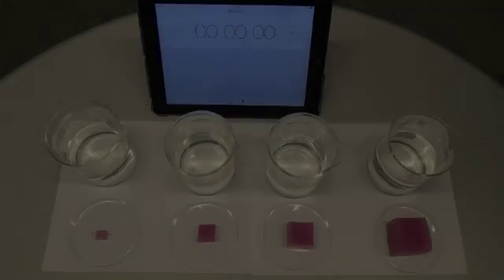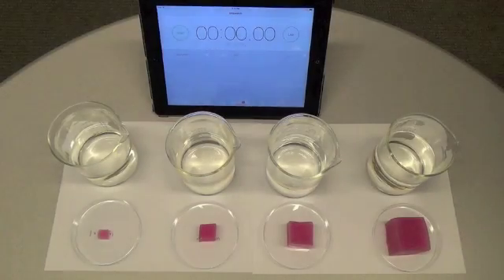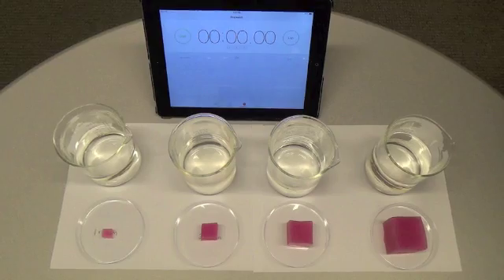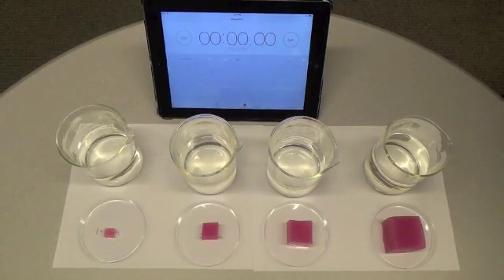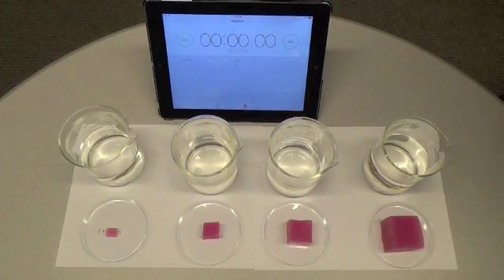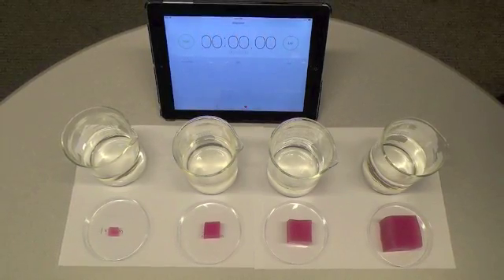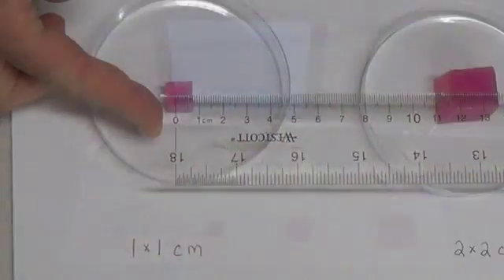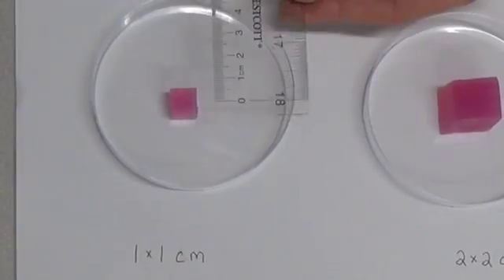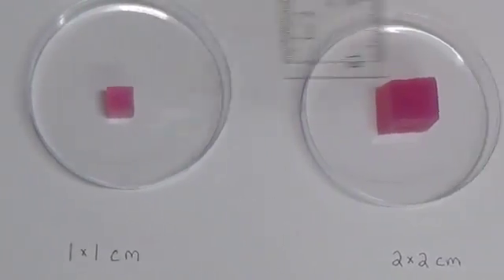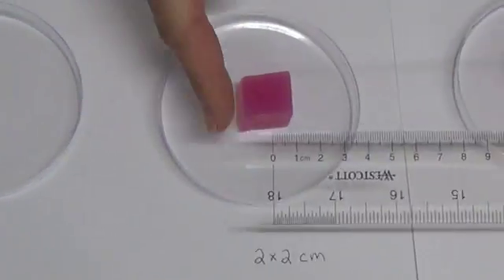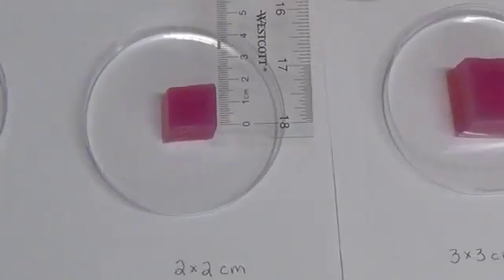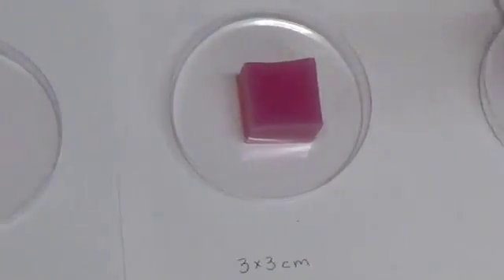This is a demonstration of agar cubes made with an acid-base indicator called phenolphthalein. You will see how acid diffuses into each cube at the same rate, changing the color from magenta to clear over time.